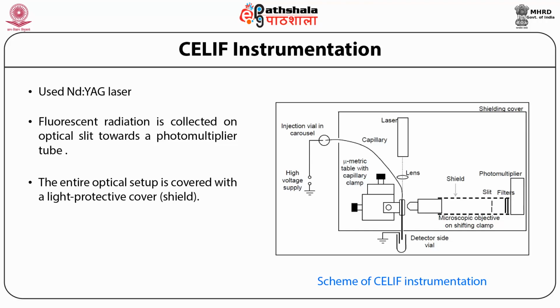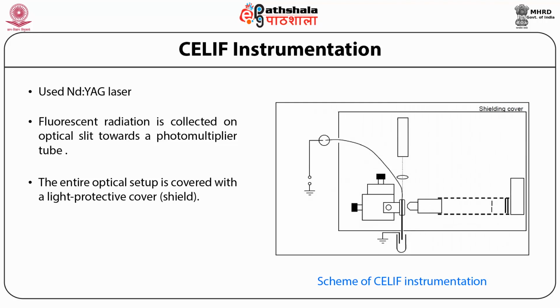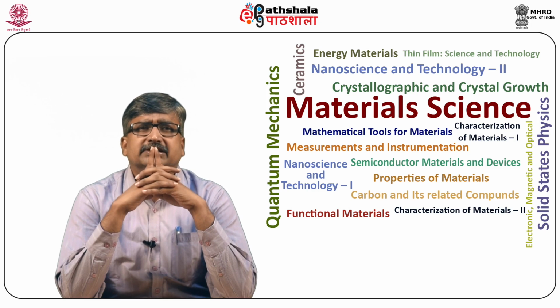The carousel with injection and background electrolyte (BGE) vials and the high voltage electrodes is placed in a protective plastic cover equipped with a safety switch, which turns off the HV if the protective cover is removed, protecting operators from electrical shock. So students, let us now summarize what we have learned in this module.